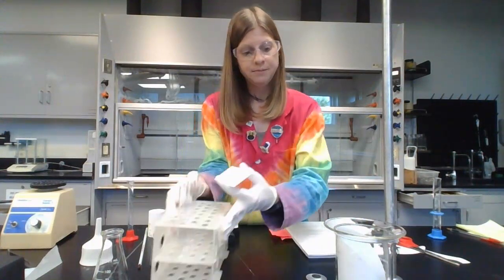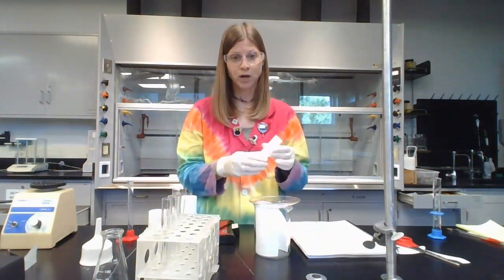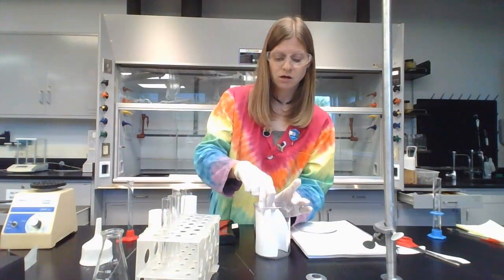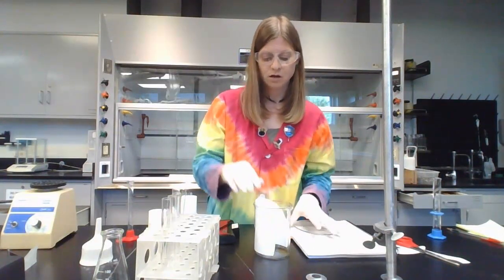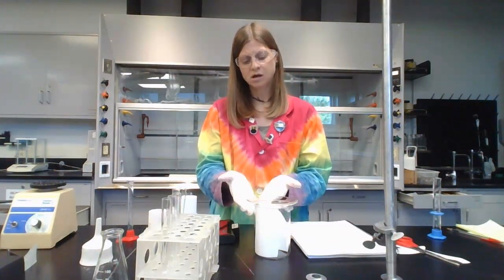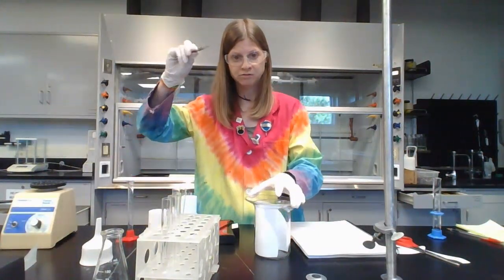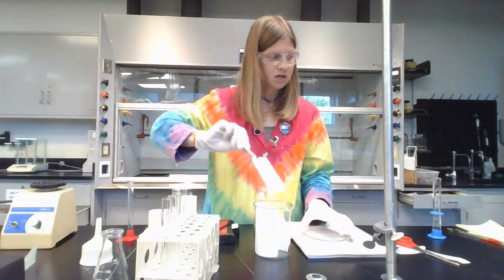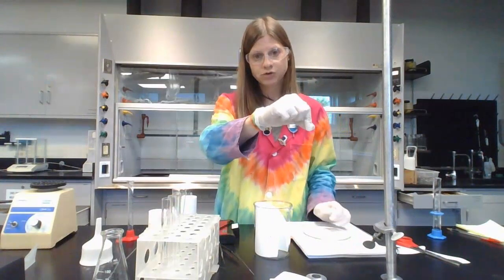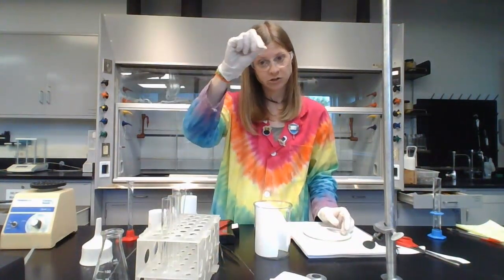Once they're on there and they're dry, you're going to get your developing chamber, which at this point has hopefully the filter paper wet. You're going to put your TLC plate into the beaker with the filter paper, put on the lid, and we're going to let the mobile phase move up the TLC plate until it gets 1 centimeter from the top. Once it's 1 centimeter from the top, you will use a pair of tweezers to remove it. Set it on a paper towel, and then take your pencil and trace the motion, or how far the solvent, the mobile phase, went. So you're just going to trace it.